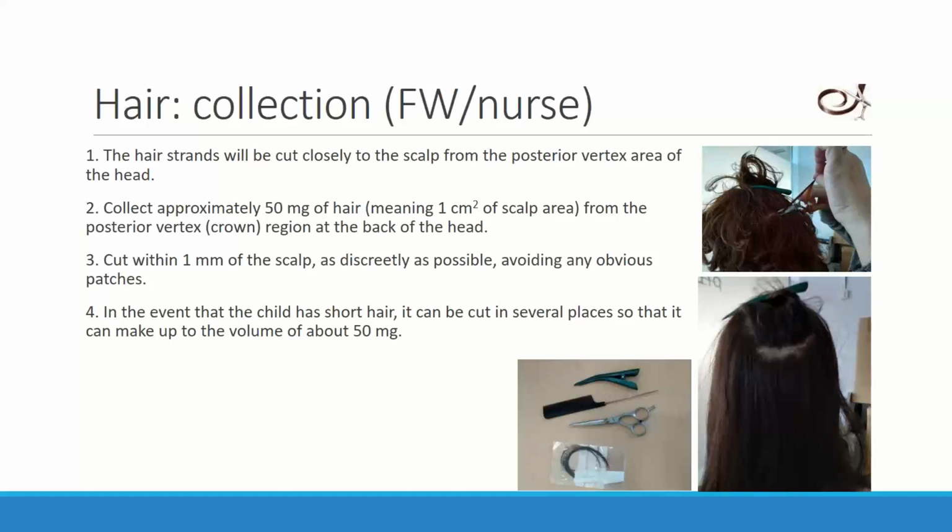When Mariana said 1 square centimeter, it's for long hair that is above the 3 centimeters length. If it's shorter, maybe you have to get a little bit more. I understand that this is a little bit complex, because the shorter the hair, the more obvious the patch is. So just for you to keep in mind.